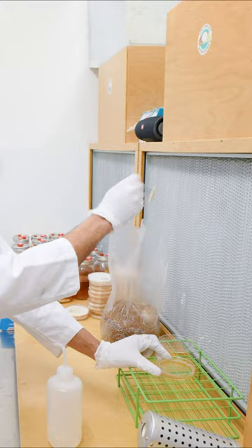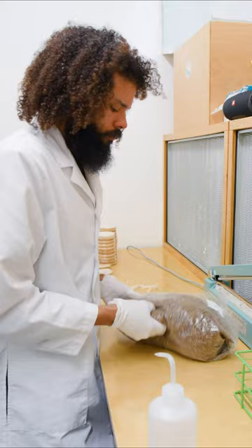Again, seal it until it's properly sealed. Break the agar wedge up through the bag as you mix it — that kind of creates more inoculation points.